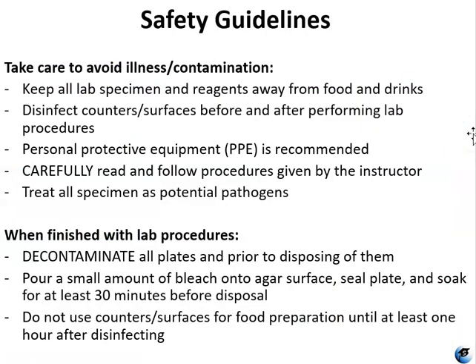As for the safety guidelines, you want to make sure that you keep all of your lab specimens and reagents away from food and drinks. Disinfect your counters at least an hour before using those counters to prepare food. You want to disinfect the counters and surfaces that you're going to be using for your labs before and after performing lab procedures. If you have access to PPE, it is highly recommended.